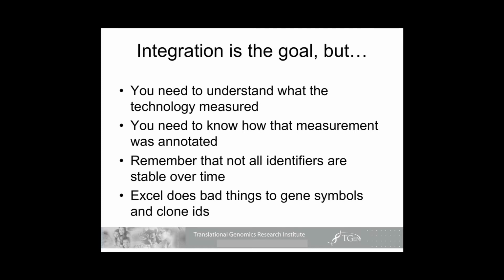Things you need to remember about this. Integration is the goal, but you need to understand what the technology measured, okay? Array-based technology is a probe-based technology. And depending upon where that probe was designed, you may or may not have unique species identification.